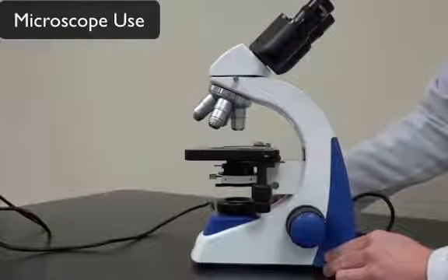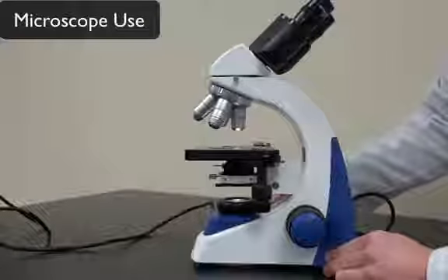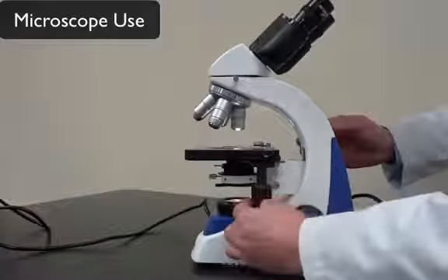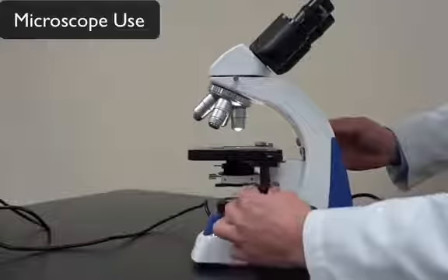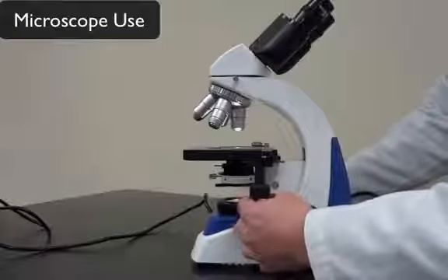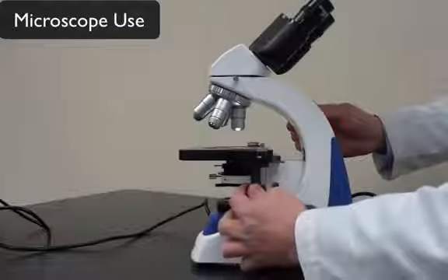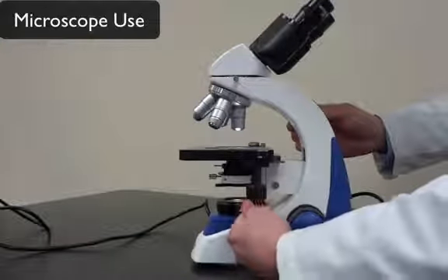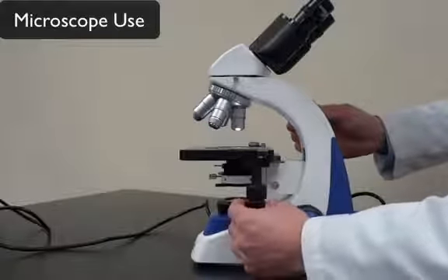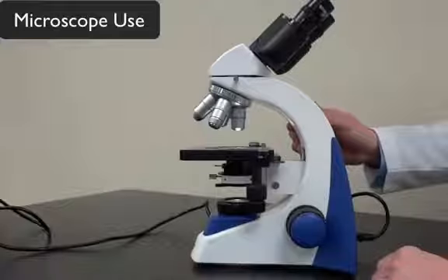So I'm going to turn on the light source very slowly, and you can see that light source come on there. Now I'm going to center, right here with our little dials, the specimen, whatever we're looking at, into the light source there. Okay, so you're going to turn it left and right, up and down, and back and forth to try to center that slide into the light source there.